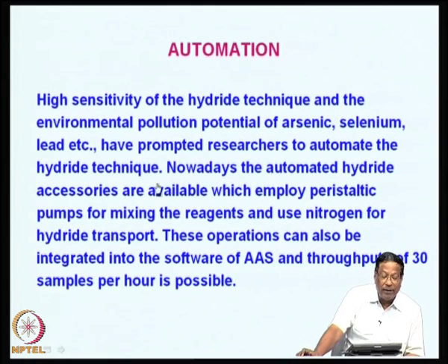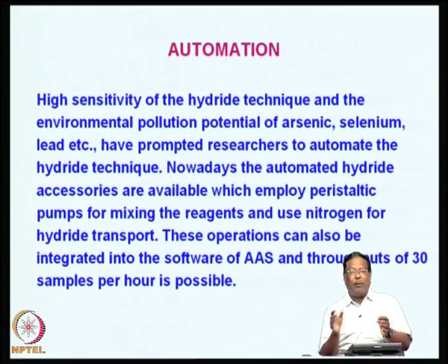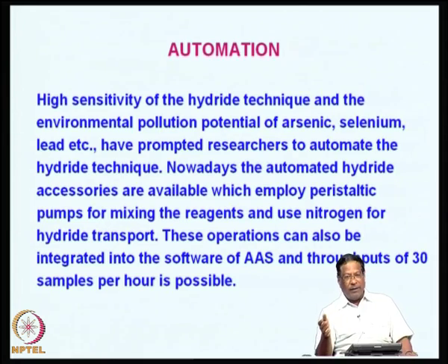the whole hydride technique. That means, you do not have to do any work, you just take a carousel and pass the acid. So, the acid addition can be automated, sample collection can be automated, drying will be automated, the sample introduction can be controlled by a solenoid valve, and you can time it at different rates. So, standard 1, standard 2, standard 3 are analyzed, and then the sample is analyzed, and then you can take the readings and then feed it to the computer to determine the concentrations.